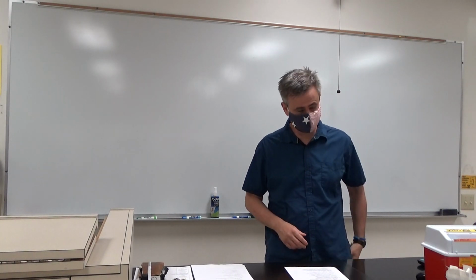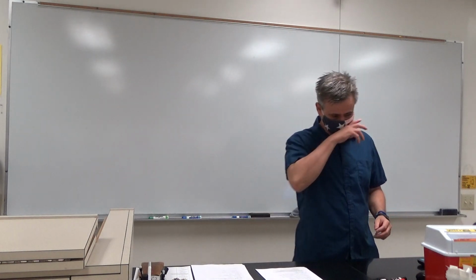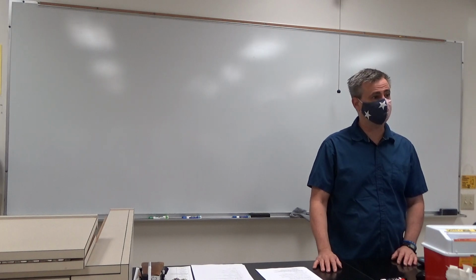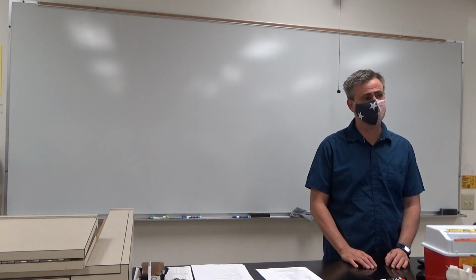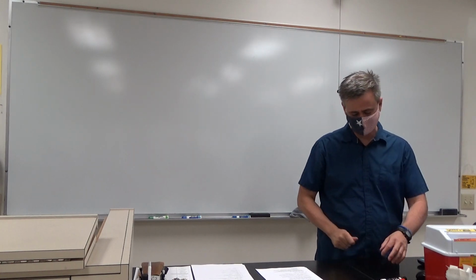Alrighty, so we are getting ready to start the pinnacle project of your organic laboratory careers. As I think I probably told you guys at some point, an overall consensus has been in the past that students find this the most challenging and the most fun at the same time, because there's a lot of independence at any given time. You're deciding, what should I do now? Help figure out what this unknown is.